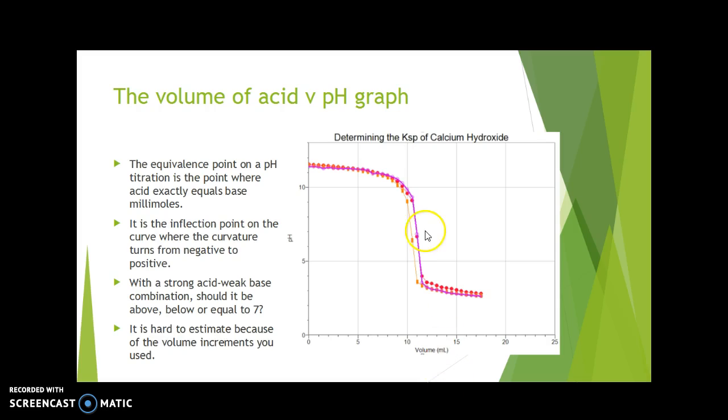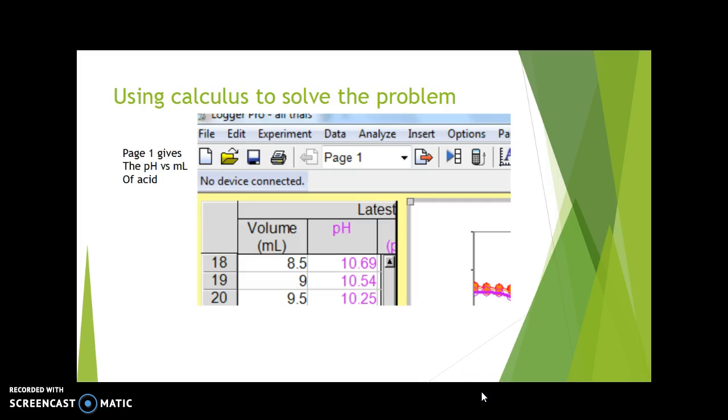It's hard to estimate here the equivalence point because you added probably 0.5 milliliter increments. So just where was the equivalence point? Well, we're going to use calculus to solve the problem.